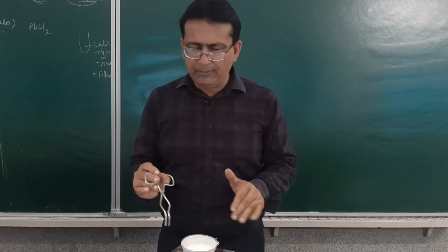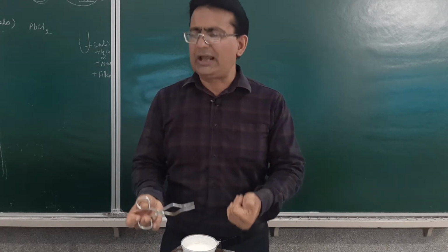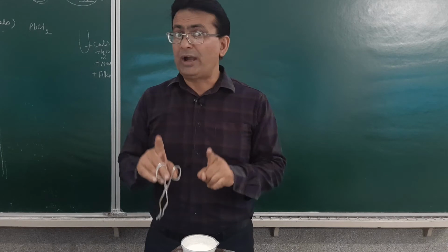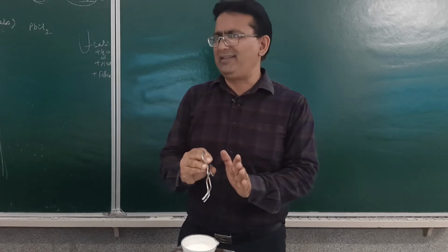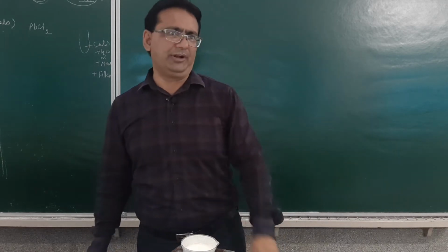Now, I am utilizing this time gap, the time it is taking to heat up, to give a lecture to you on how you have to carry out the practical. But while you will be doing the practical, you don't have so much time. So in the meantime, while it is getting heated up, you will be carrying out the other tests, so that time is not wasted in the examination.